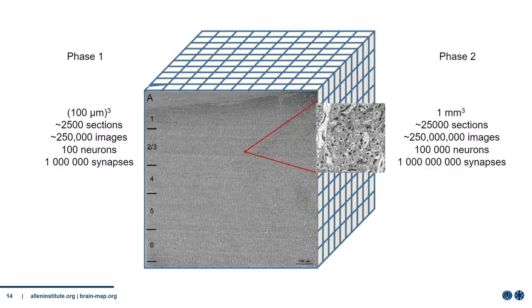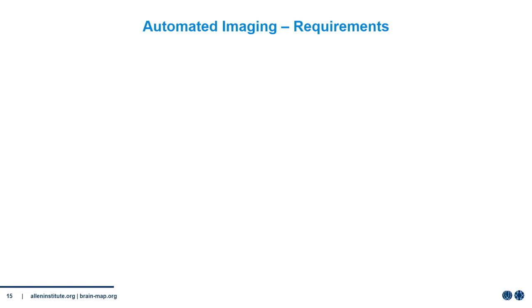And then here is an example slide of a 1x1 millimeter montage, and here's actually one of the tiles of that montage at full resolution. Well, downsampled a little bit. So what are the requirements to actually modify an electron microscope to keep up with the required data rates?